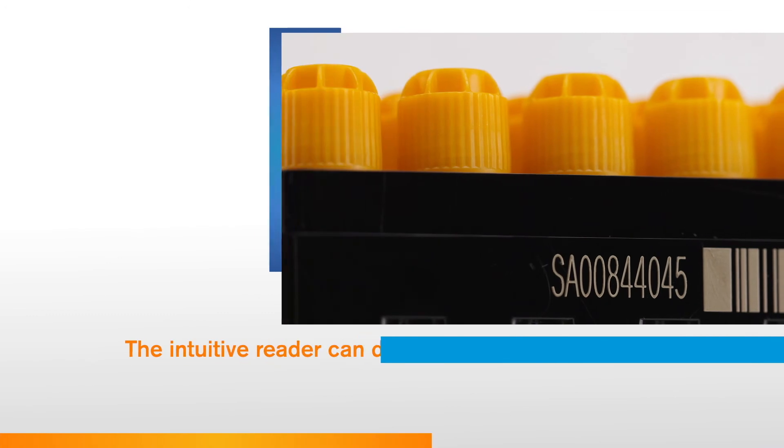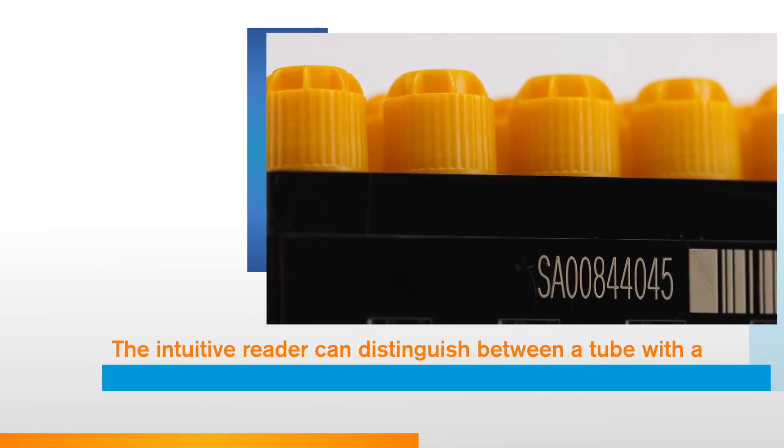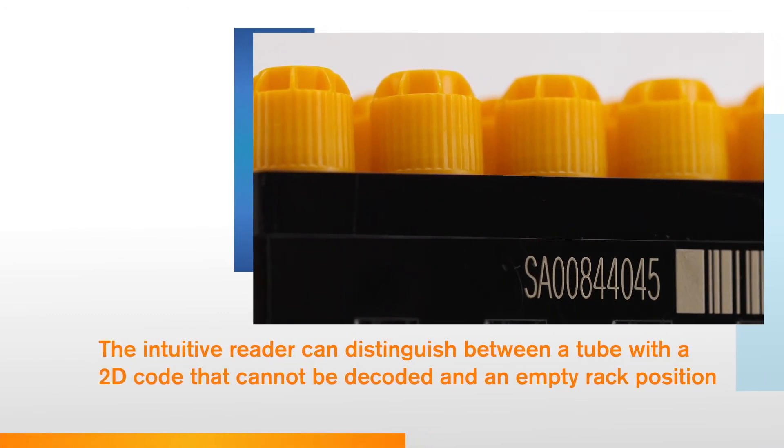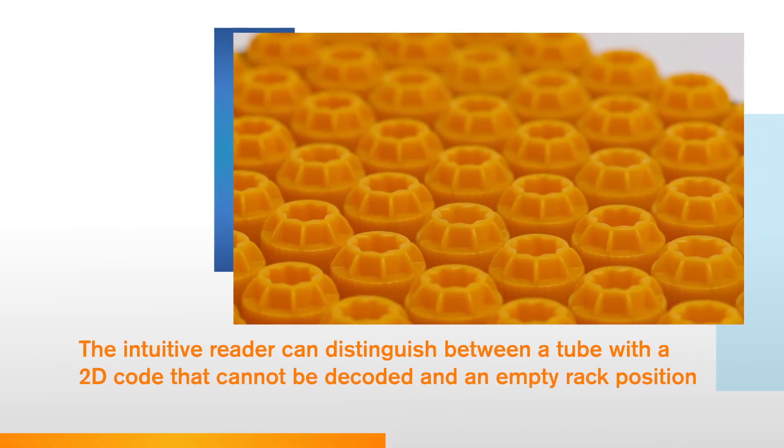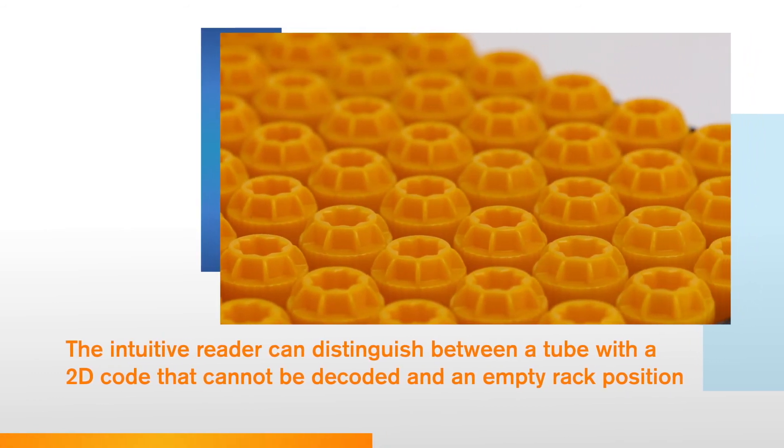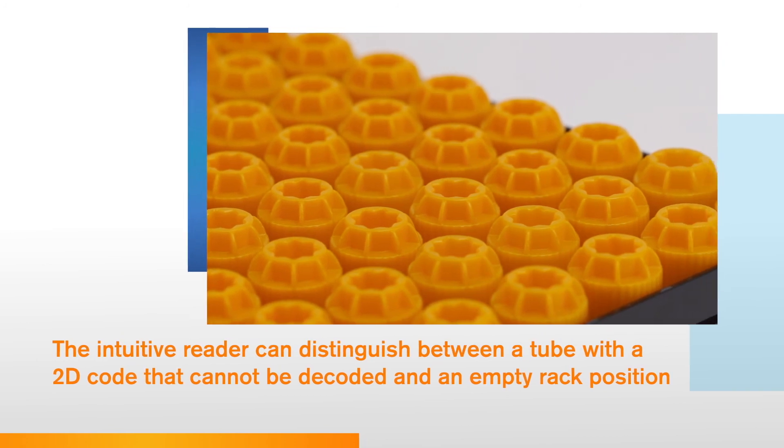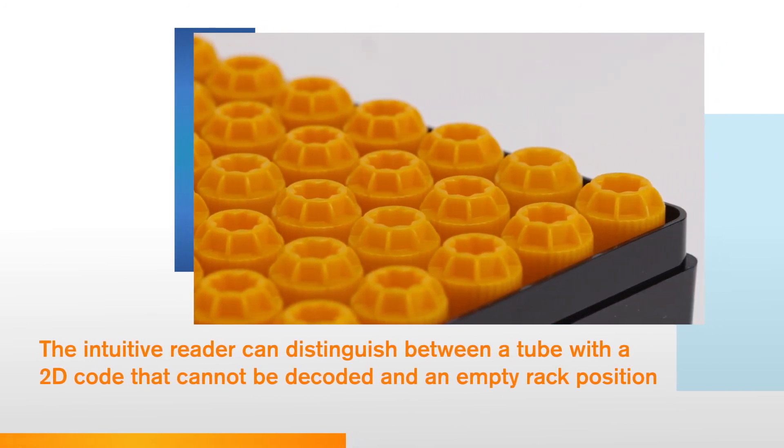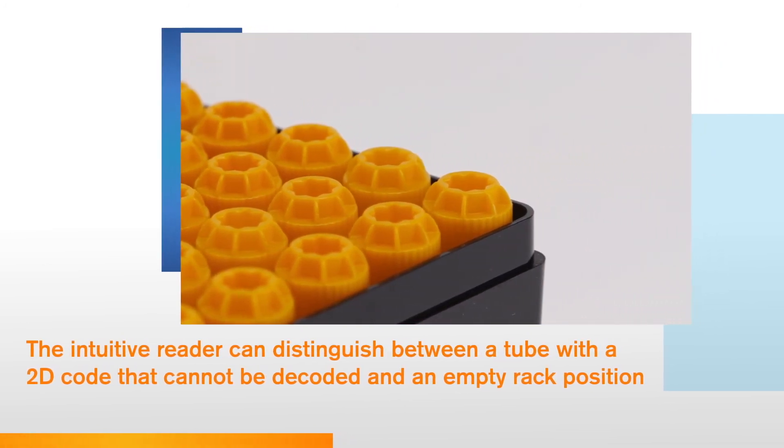The intuitive reader can distinguish between a tube with a 2D code that cannot be decoded and an empty rack position. It won't attempt to decode empty tube positions, so your data files are kept clean and time wasted identifying and erasing invalid data entry is eliminated.